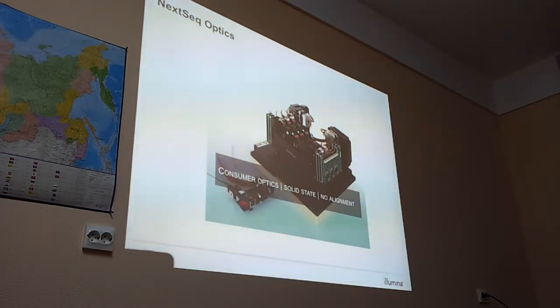So almost everything, not the full capacity, but almost. You can continue to work, but you should tell Interlabservis, and we will order a new optical unit, and when it's there, we can just exchange it quickly. So that's the idea.